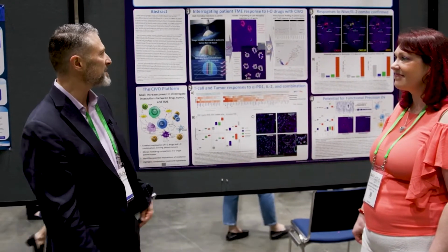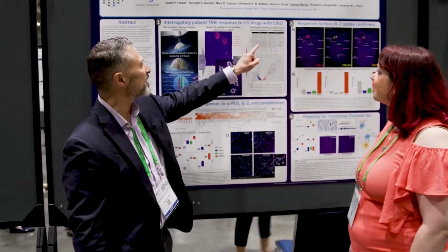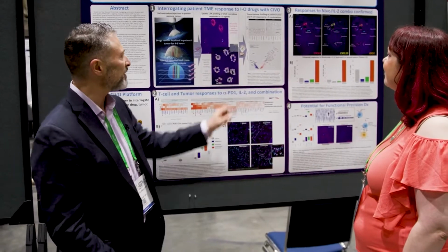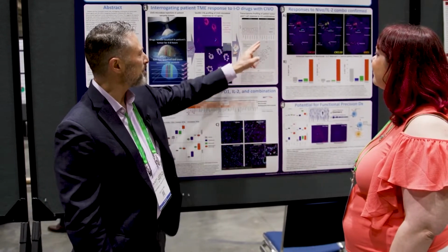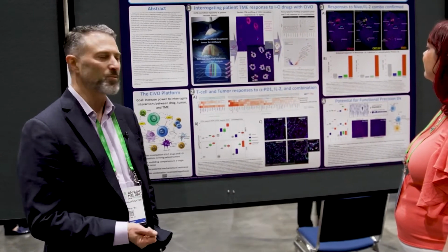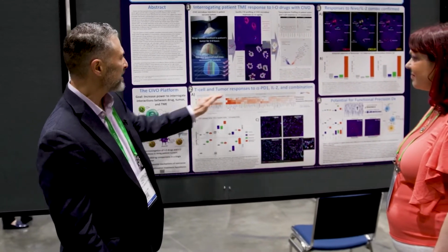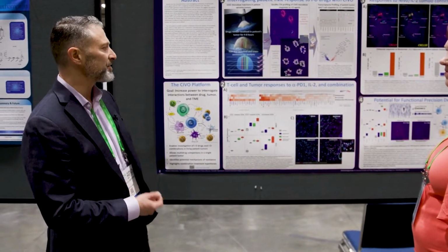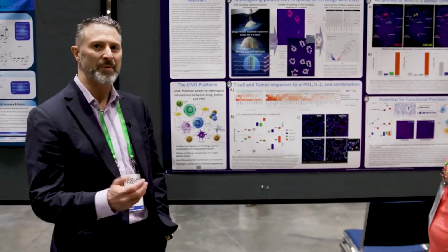In this case, we applied a T-cell mask to better understand what spatially transcriptional events are occurring in the T cells versus non-T cells. And I can tell you that based on enrichment of the classic T cell marker CD3 itself, as well as many other markers of T cells, the mask using the DSP system worked really, really well. And here's just one example of a patient which received anti-PD-1, IL-2, and the combination of the 2.